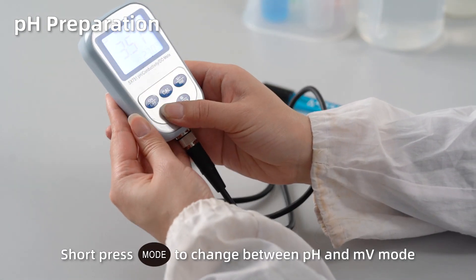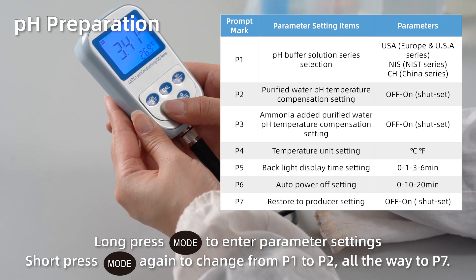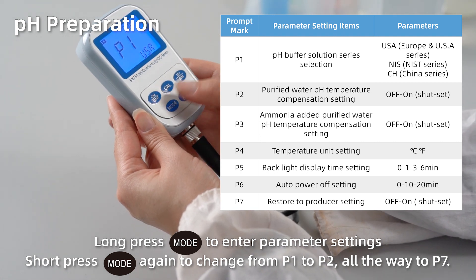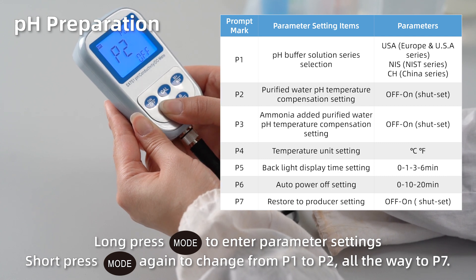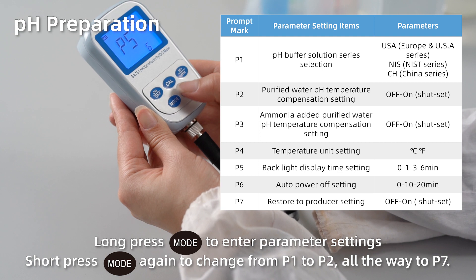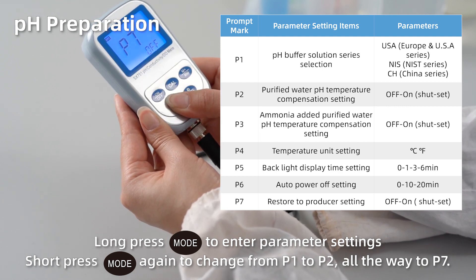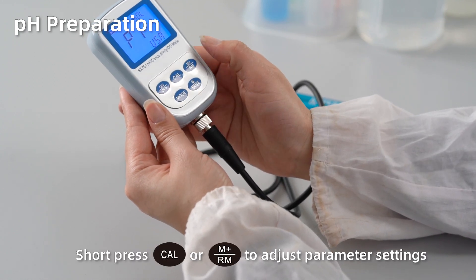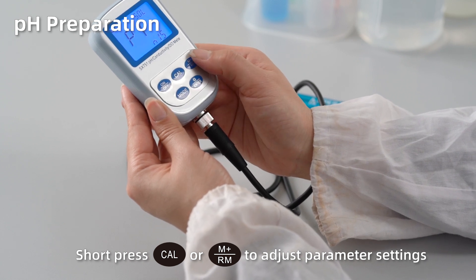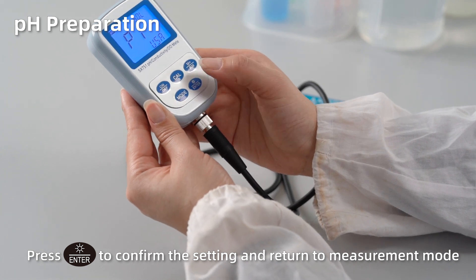Short press Mode to change between pH and mV mode. Long press Mode to enter parameter settings. Short press Mode again to change from P1 to P2, all the way to P7. Short press Cal or M+ to adjust parameter settings. Press Enter to confirm the setting and return to measurement mode.